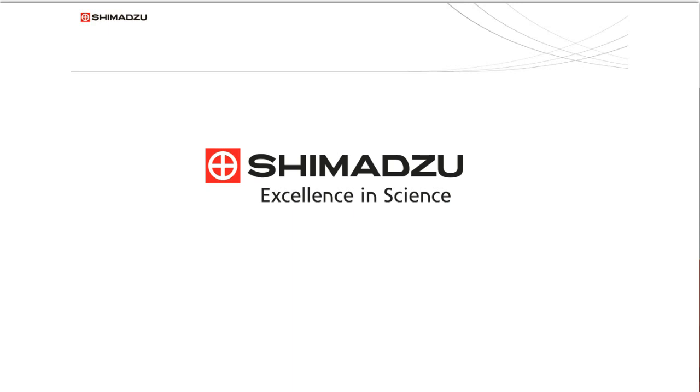All right, next question. What are the newest cutting edge chiral stationary phases? Most of the ones that I've seen out there, especially in the pharmaceutical industry, have come out of companies like Chiral Technologies. They've really pioneered the immobilized CSPs out there.